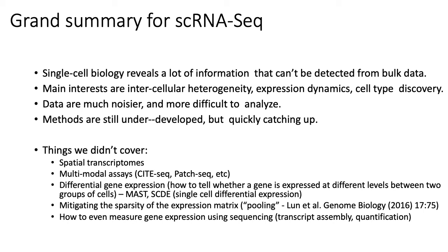We also didn't really discuss multimodal assays, and so multimodal assays refer to single cell sequencing protocols where you collect more than one type of data. And so, for example, CITE-seq refers to technologies that allow you to both measure RNA sequencing and certain protein measurements of the same cell. There's assays that allow you to do both ATAC-seq and RNA-seq at the same time for individual cells. Assays like Patch-seq allow you to simultaneously measure RNA-seq of a neuron, measure electrophysiological recordings on those neurons, and measure the physical morphology of those neurons all at the same time.